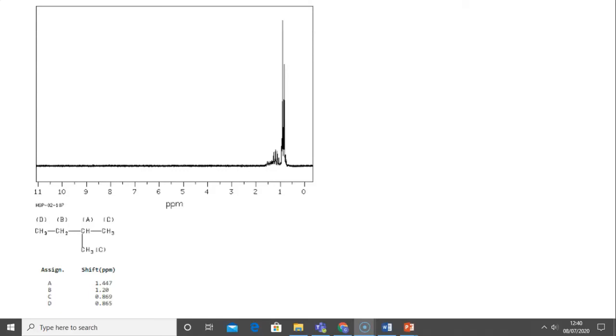So they do tend to go on top of one another, which is why you can't see 4 clear, distinct signals. In the exam, we would either zoom in on the range 0 to 2.5, so you could see them in much more detail, or we would clean them up for you so they look a lot cleaner. But there are technically 4 different signals here.